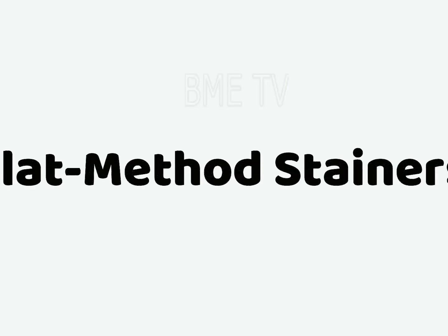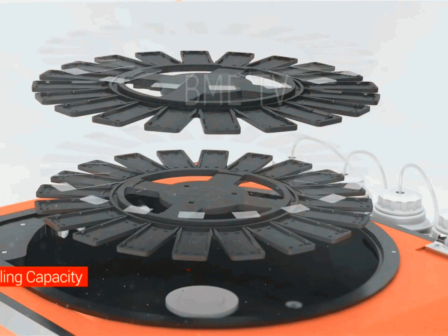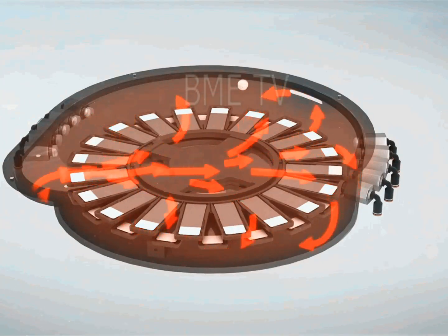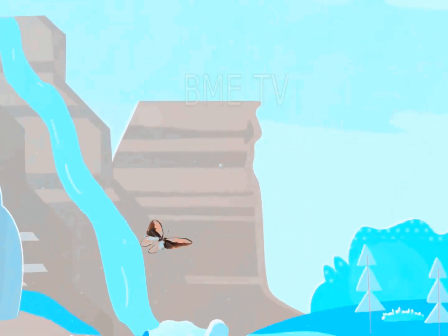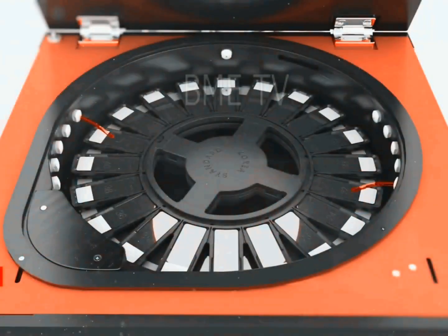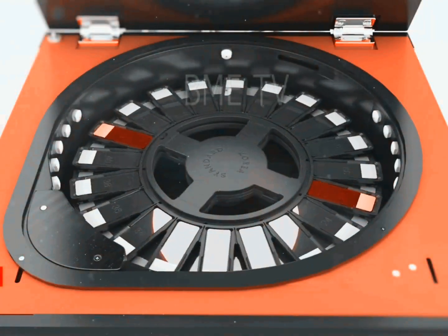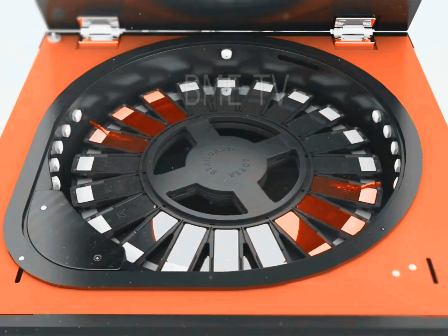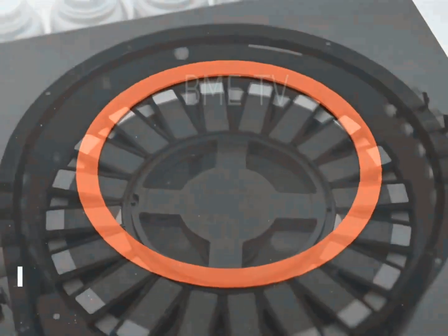The third type of stainer is flat method stainers. Flat method stainers drop staining solutions onto the specimen as the slide lies flat within the stainer. Many immunohistochemistry stainers use this principle. Some employ robotic arms to apply solutions to the slides. Some flat method stainers use a robotic arm programmed with XY coordinates to pick up and apply solutions to slides located in a rectangular grid. Other instruments employ a rotating carousel and swinging arm. The arm picks up reagents and dispenses them as the slides move.